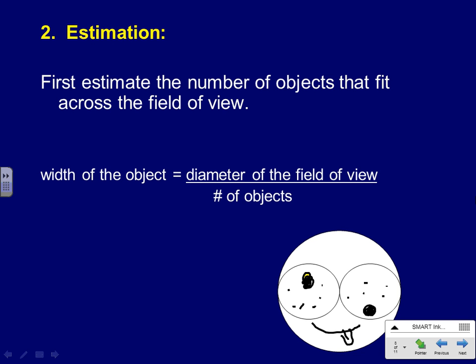We're not worried about the rest of the space. We're worried about determining the dimensions of the cell that's in there. So I'm only really worried about this distance across here. Now the picture's really getting goofy. Anyway, we're worried about what that distance is, okay? And if we know what the entire distance is, and we estimate that 2 of these fit across, then we know the size of that thing, right? We're really just getting an estimation.